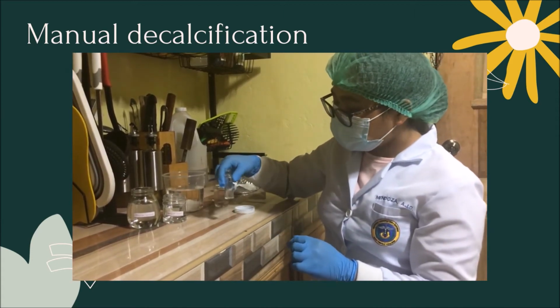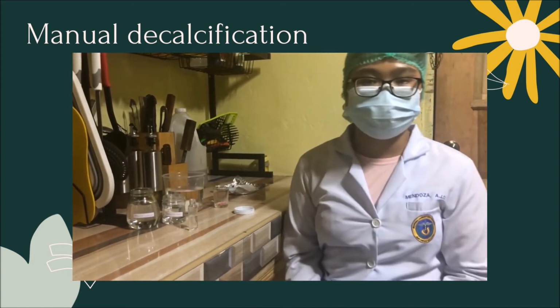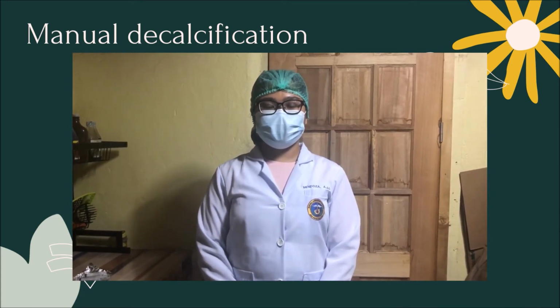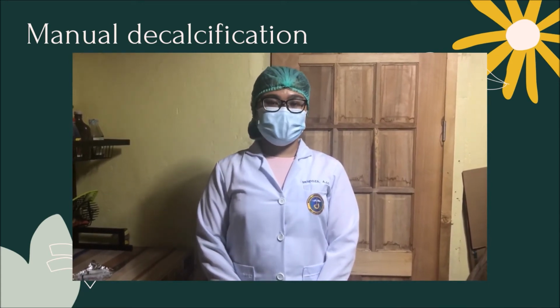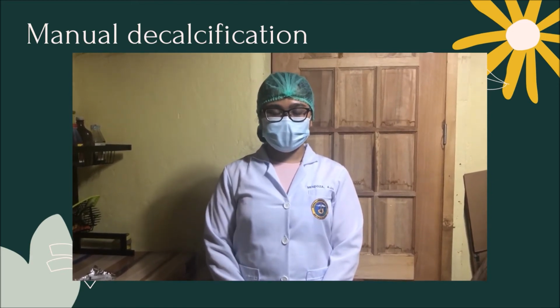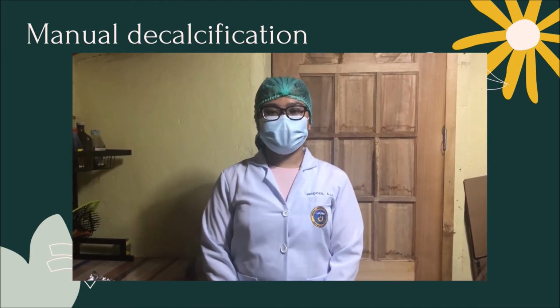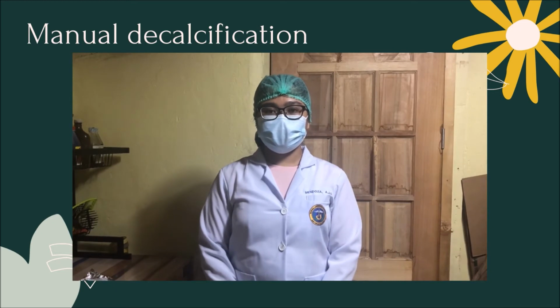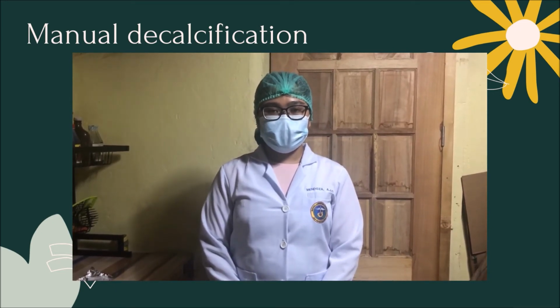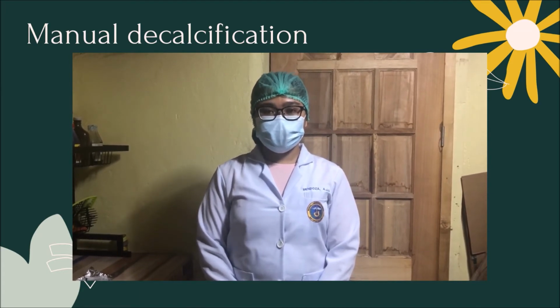Now mix it well and allow it to stand at room temperature for 30 minutes. For the interpretation of the results, if there is a formation of precipitation after adding ammonium hydroxide, then there is still presence of calcium and we should further decalcify the tissue. Also, if there is a formation of precipitation after adding ammonium oxalate, then there is still minimal amounts of calcium. However, if the solution is clear after 30 minutes and even after adding ammonium oxalate, then the solution is calcium-free.